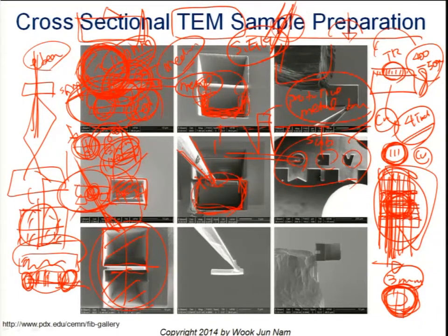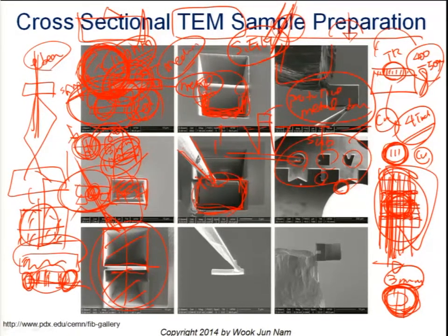So if you slice multiple samples out, you just take one sample from some area and mount it on port A, and then sample number B from the other area, and mount it on port number B or something like that. So using that way, you can mount as many samples from many different interesting areas, and then you can integrate all those samples into one copper grid.